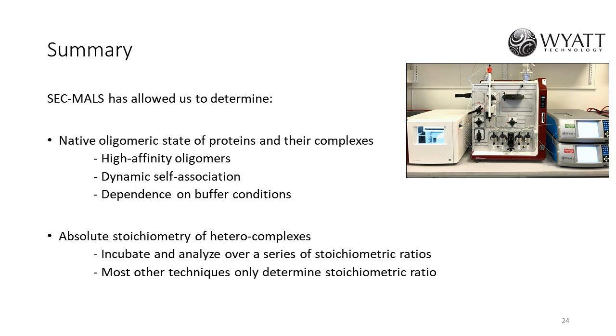Okay, thank you. Oligomerization is concentration dependent. How sensitive are your results to the specific sample concentration that is measured? And would you find different results at higher or lower concentrations than the one you measured?